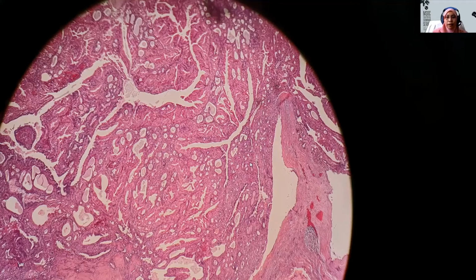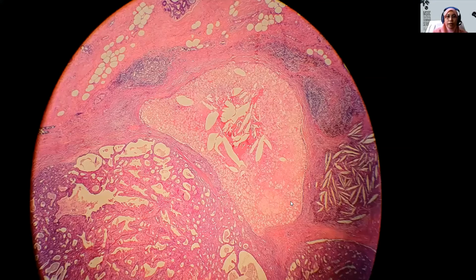At the edge of the lesion, there are aggregates of histiocytes, hemosiderin-laden foamy histiocytes, cholesterol clefts, and this is the lesion with apocrine changes.